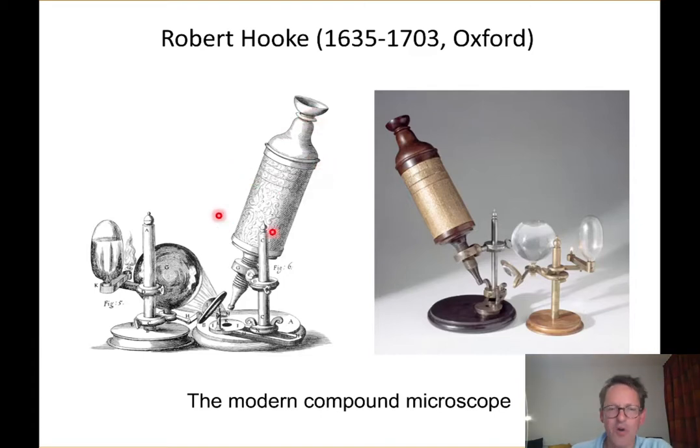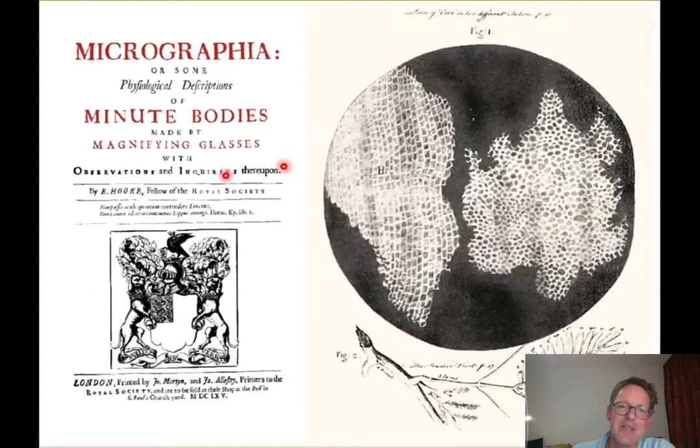And it's called a compound microscope because it consists of both an objective lens and the tube lens in combination. And this is very much of what a modern microscope consists of today. We have better lenses and we have slightly more complex systems, but it is that simple system of objective lens and tube lens that we consider in this course.